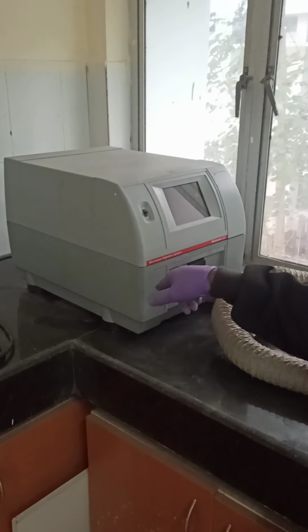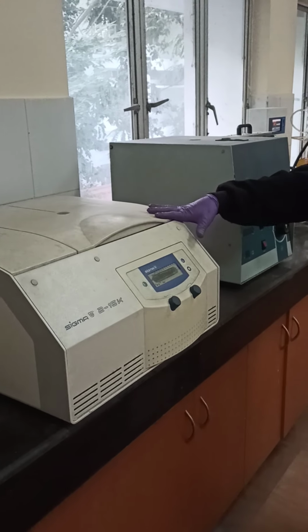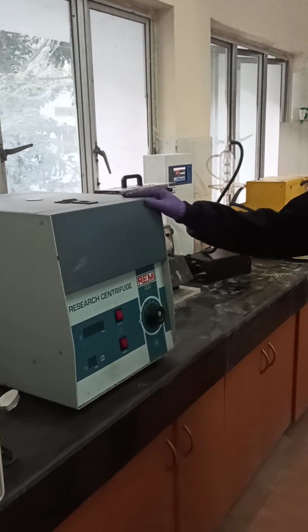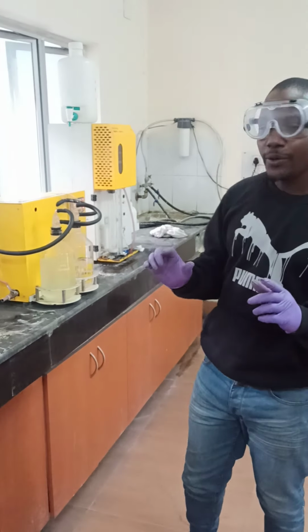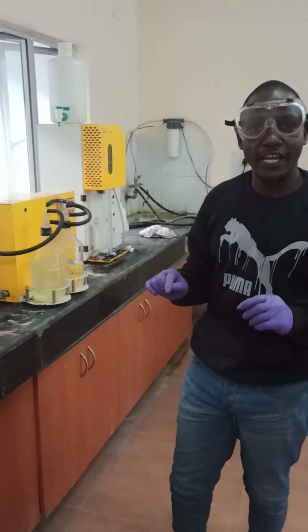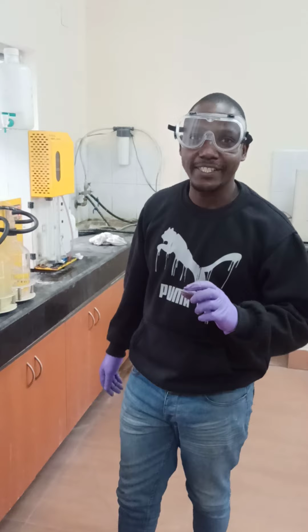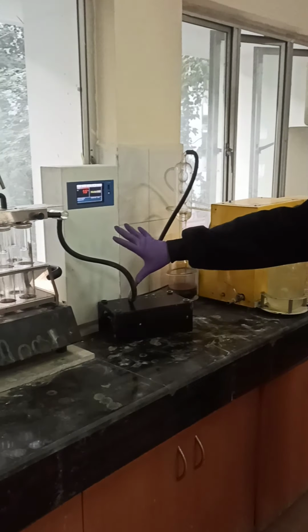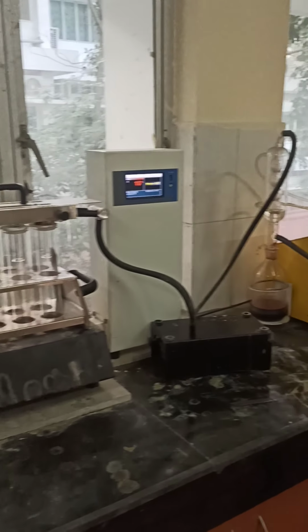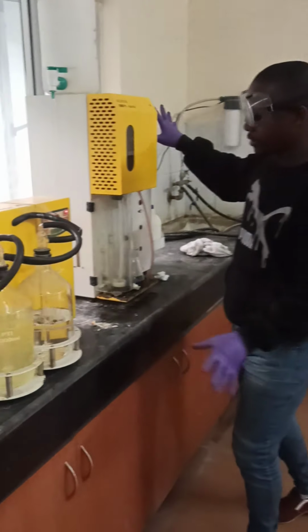Microwave digester systems. And then we come here. I will show you. These are the other instruments, very useful ones. The centrifuge, it's here. But for sure, today I'm going to explain to you a bit about the so-called automated nitrogen detection system. This is the system itself that I'm talking about. This is the so-called automated nitrogen detection system, with which I am still performing some experiments up to now.